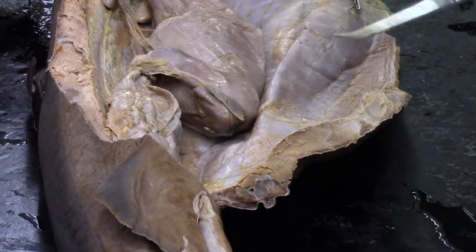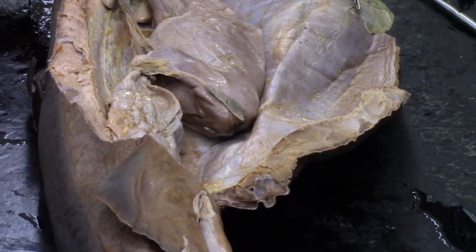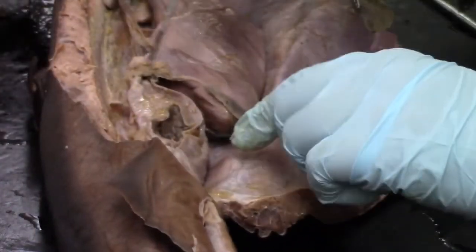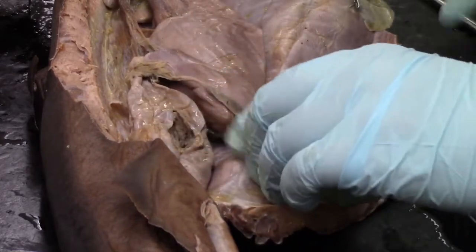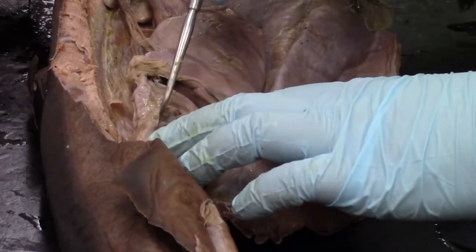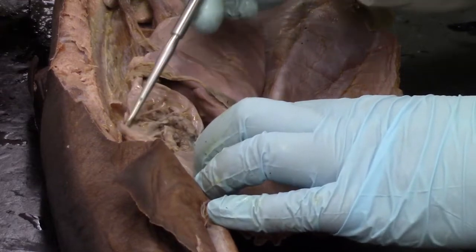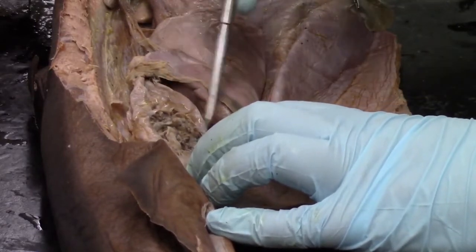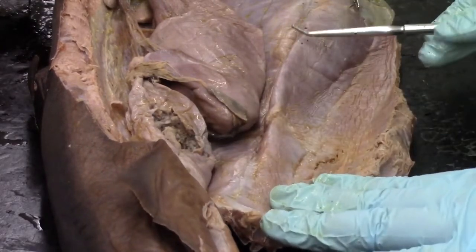Now, I mentioned that this is known as a spiral intestine, and I'm going to show you why that is by just cutting into it. You can see the internal structure of the intestine. It literally goes in the pattern of a spiral. So our intestines are quite long to give more surface area for absorption of nutrients, and a bit of a modification here for the dogfish is they've got that extra surface area, but it's in the form of these spiraling tunnels within the spiral intestine.